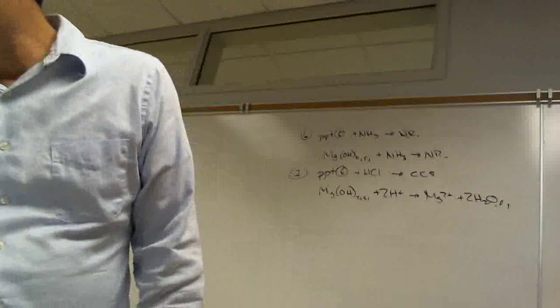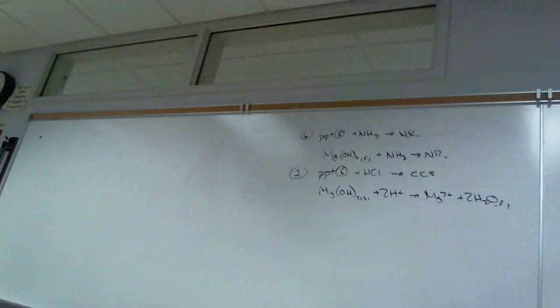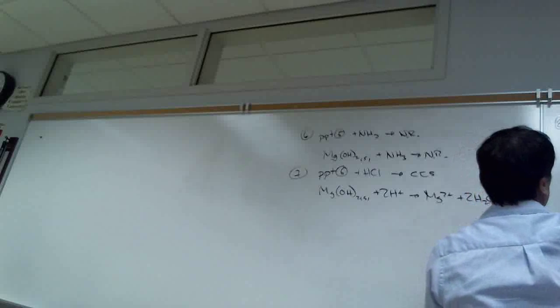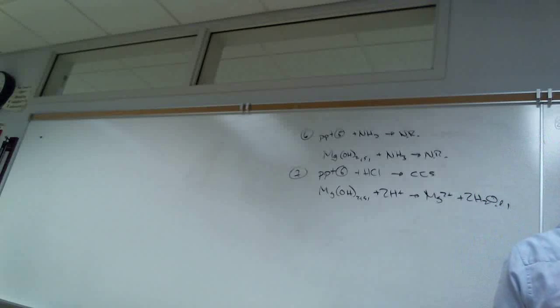Okay, in the next step, we're going to add magnesium reagent and sodium hydroxide. And so we destroy the precipitate. Now we're going to reform it, but we're going to reform it with magnesium reagent. And so here we'll take the solution from 6 plus sodium hydroxide plus magnesium reagent yields the magnesium hydroxide. What color is it? Blue. Blue-purple lake, right? Gelatinous precipitate, the blue lake.